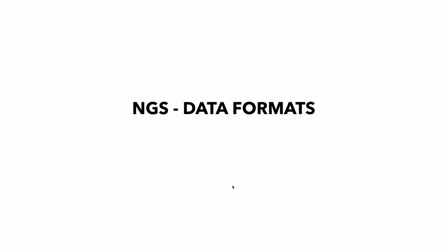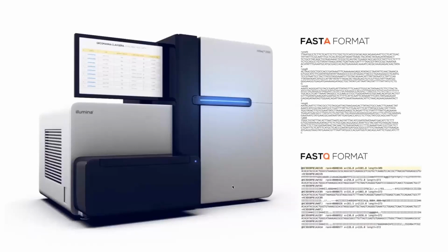So what is the SRA format, and what is included, and what kinds of NGS data formats are there? First of all, the Illumina sequencer will produce two types of formats, and we'll kind of talk exclusively about Illumina, even though there are some other ones, and there is some overlap there. So you will hear formats like the BAM format, the SAM format, but all of them are derivatives or could be converted to some of these formats that we have in front of us, the FASTQ and the FASTA. So what is the FASTA format and the FASTQ formats that we will be looking at?